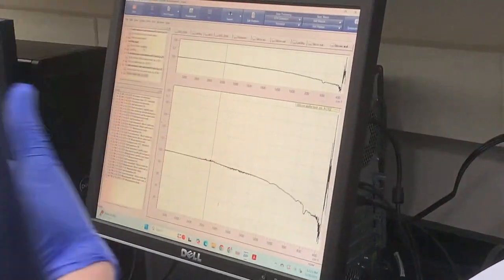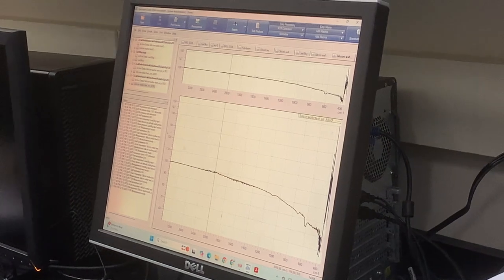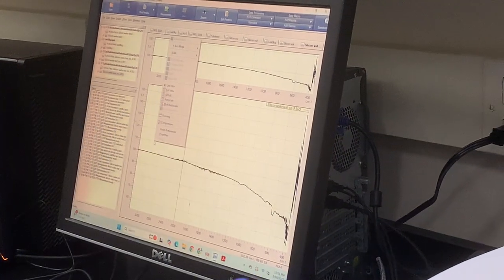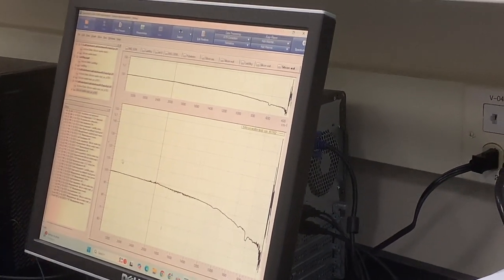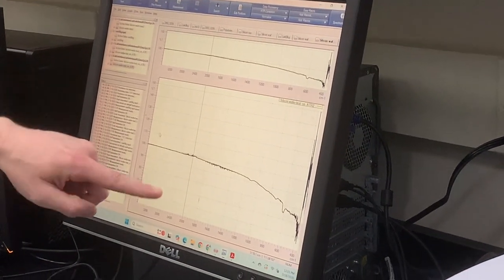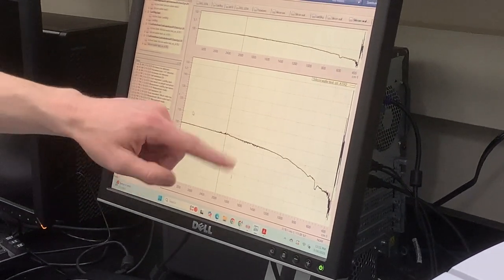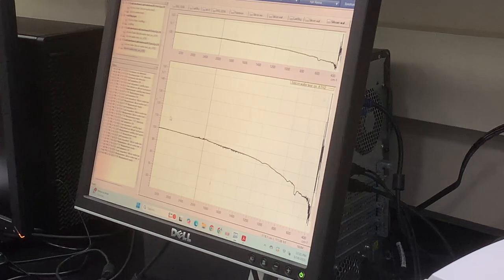I'm just trying to understand the data. Or maybe it's kind of false data because it's a big sample. I believe there's no transmittance here, because with IR, as it dips, it means there's no stretches.